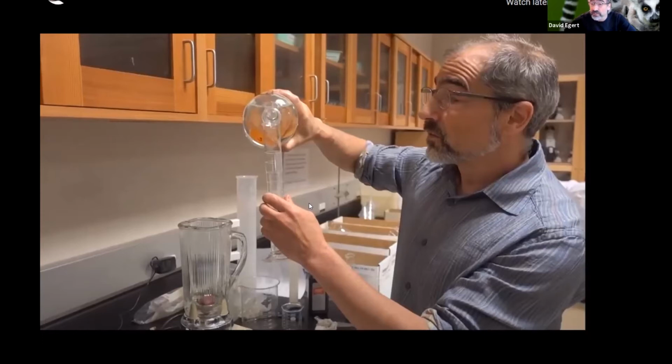What kind of things can denature enzymes? Temperature, we're going to have to be careful about temperature, pH. So we're using a buffer to make sure the pH is stabilized, right? That would be a huge source of variability. If we were not controlling for pH, that would be a huge source of variability that could affect our results quite dramatically.